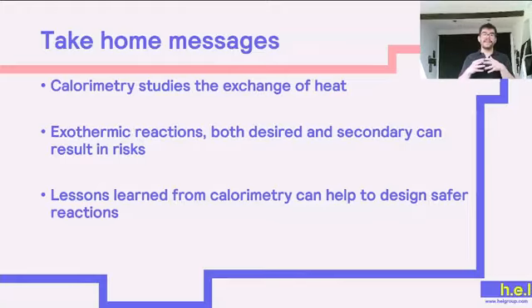Before we leave, I just want some messages for you to take home. The first one is that calorimetry studies the exchange of heat, and exothermic reactions, both desired and secondary, can result in risks. However, nothing is a loss, because lessons learned from calorimetry can help us to design safer reactions.